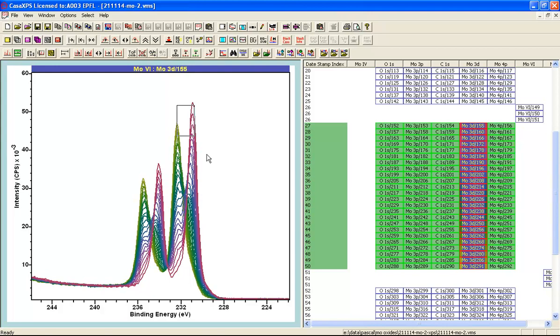So an evolution is occurring, and one explanation for such an evolution is that the sample is charging positively with time. If it charges positively with time, that means that electrons are retarded as they leave the surface and they lose energy. So that would be the basic explanation. However, there is another explanation that is related to how these data were acquired. All three data sets from three different samples were acquired using charge neutralization and also connected to ground. That is to say, the sample is connected to ground, so electrons can move through the ground to the sample holder and onto the sample.